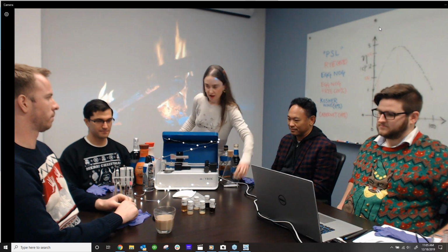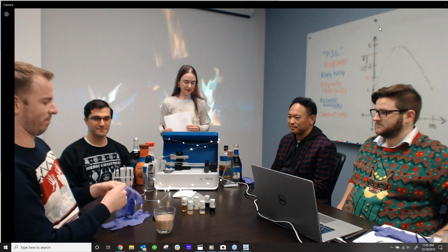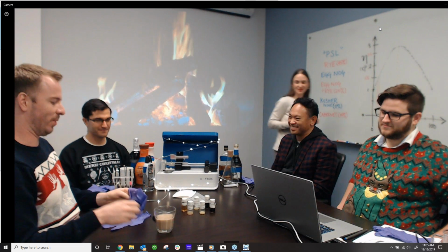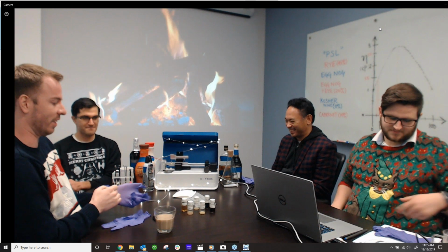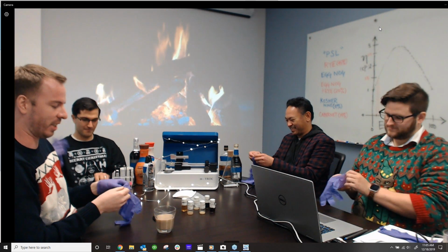Okay, so I think we're going to start with Nate. He's going to start with everyone's favorite seasonal beverage. Yes. And I'll step out of the way and let him get started. So first, before we get down to business, I want to make sure we're taking the proper precautions. So we're wearing our PPE here, so I'm just going to put on some gloves really quick.